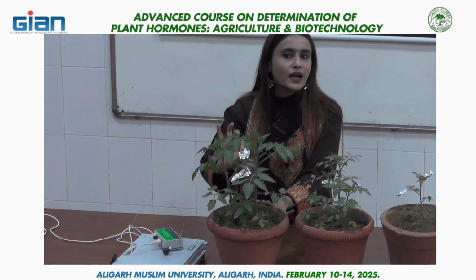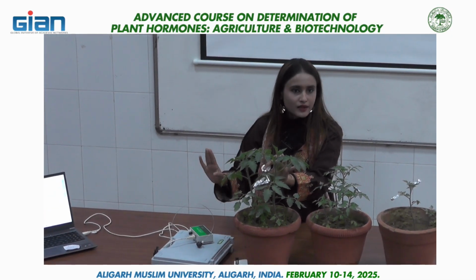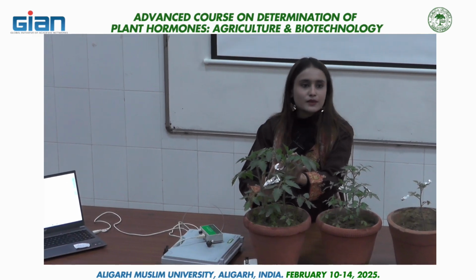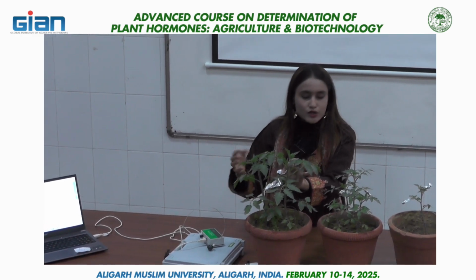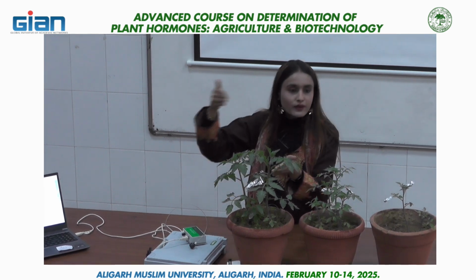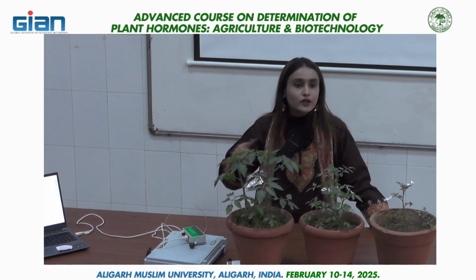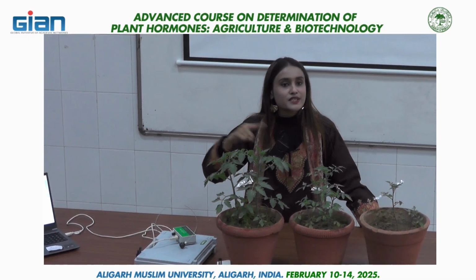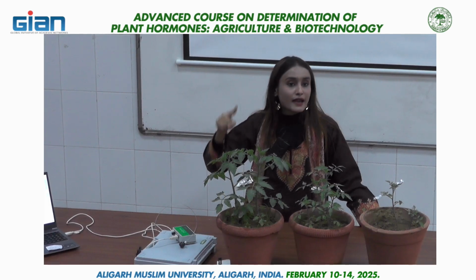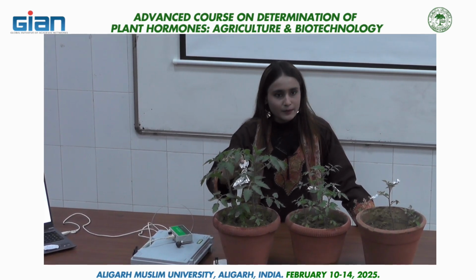So when we are covering our leaf with foil paper, this leaf is getting no light, meaning it is dark adapted. It is starving. Here photosystem 2 is open. So whenever we remove this foil and light falls on it, PS2 will activate itself, and plastoquinone quenching will start to its peak. So we are going to get Fm, or F max, here when our sample is dark adapted.